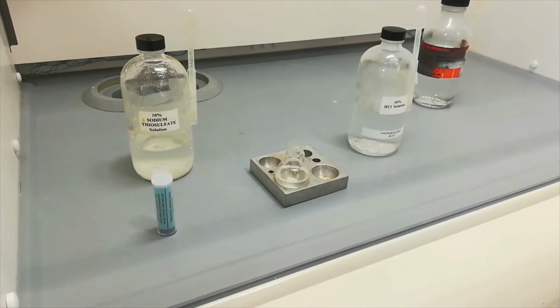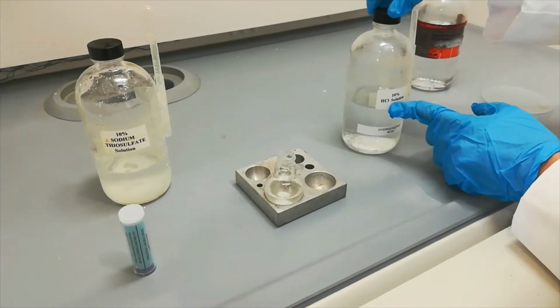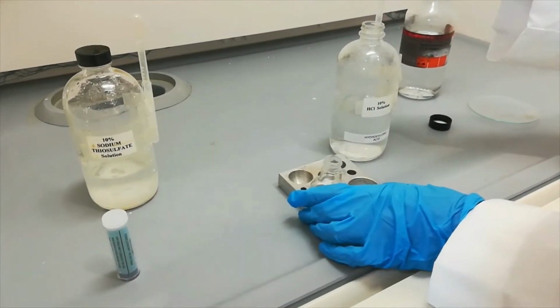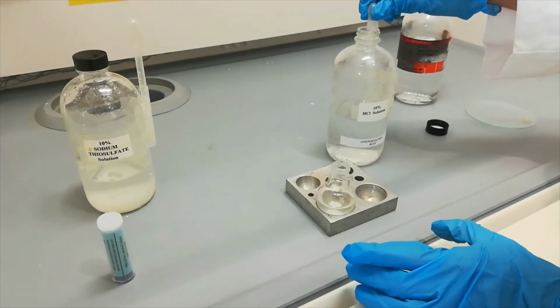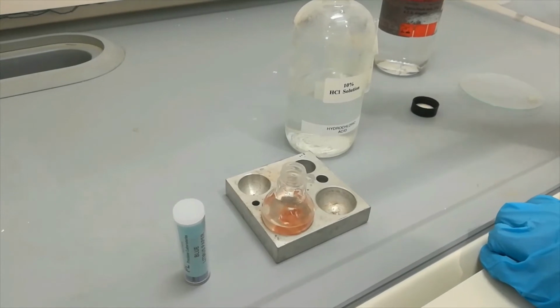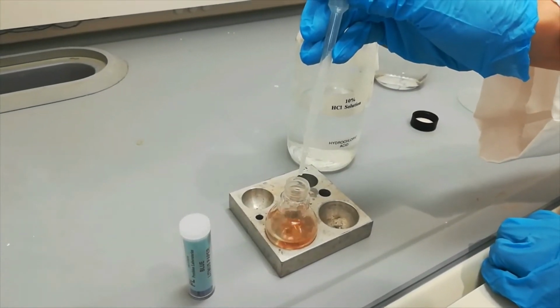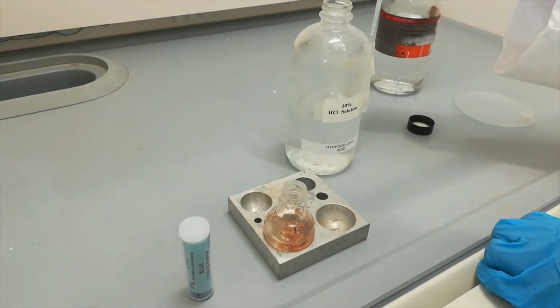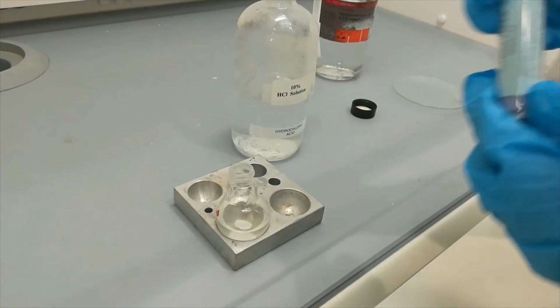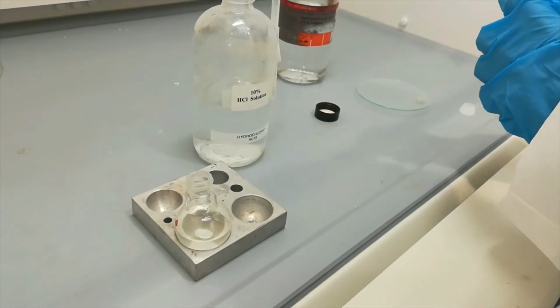Next step is to acidify the solution. We introduce acid into the solution by adding 10% hydrochloric acid solution dropwise. The acidity was checked using litmus paper. Notice the change in color with the addition of hydrochloric acid. We will also be shaking the flask so that the acid reacts completely, and after every little addition, we also need to check the acidity using litmus paper. The solution should be just acidic.